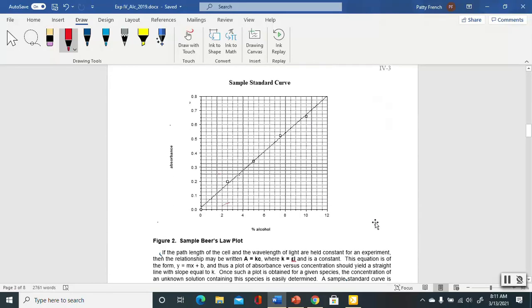Okay, so good. Now we know that we can use the Beer-Lambert law to find concentrations from absorbances. That's great, but I don't know the molar absorptivity. How do I figure that out? Because that's certainly important. We've got this, we know this, we want this, and we've got this molar absorptivity that's an unknown. Well, we're going to get around that.